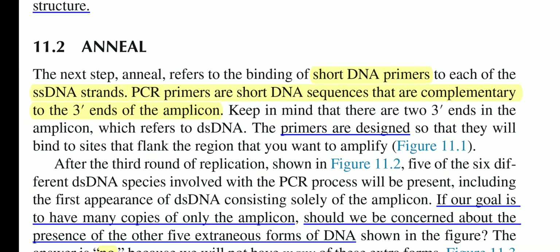Anneal. So what is annealing? The annealing step refers to the binding of the primer, that short oligonucleotide sequence complementary to your desired gene to be cloned, to be replicated. That means the primer binds with your DNA molecule, the target DNA sample.